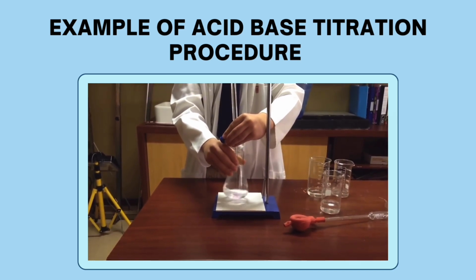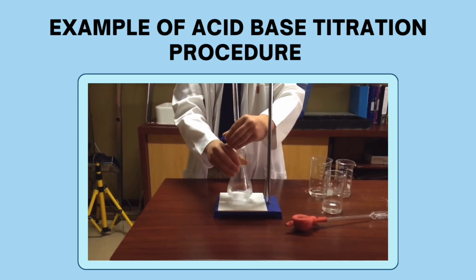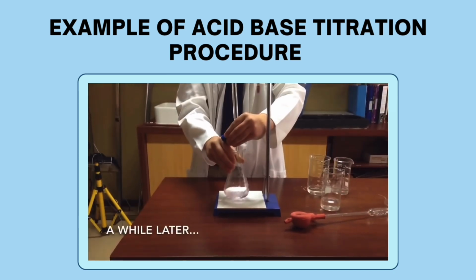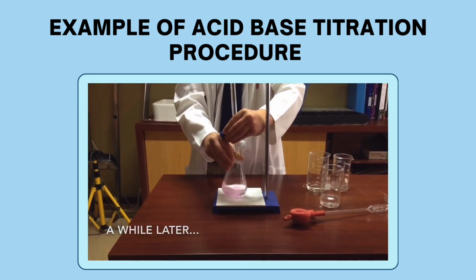and you'll see that the pink stays longer the further we go. So you carry on. So you want the rosy pink to stay.